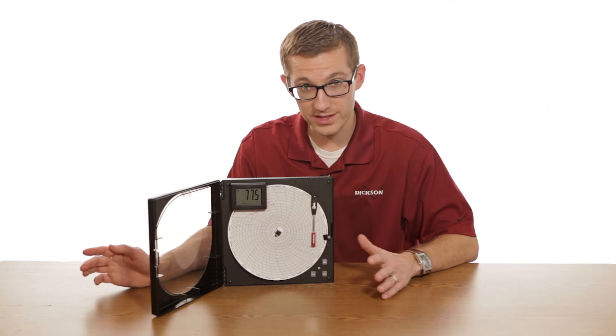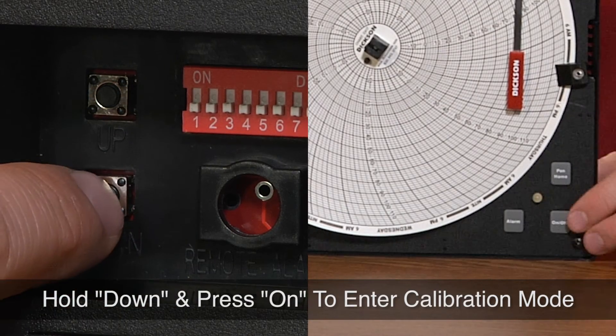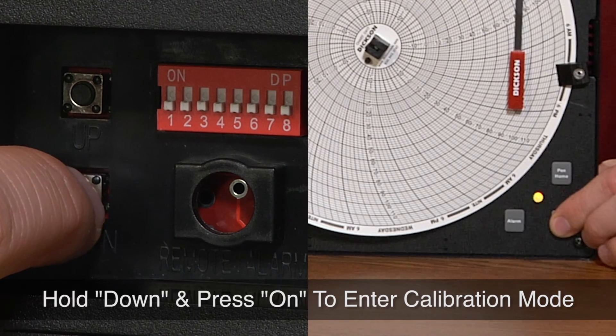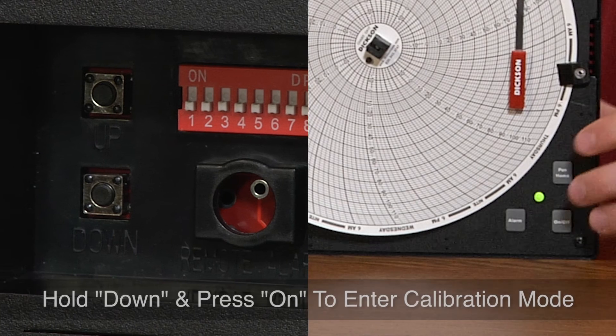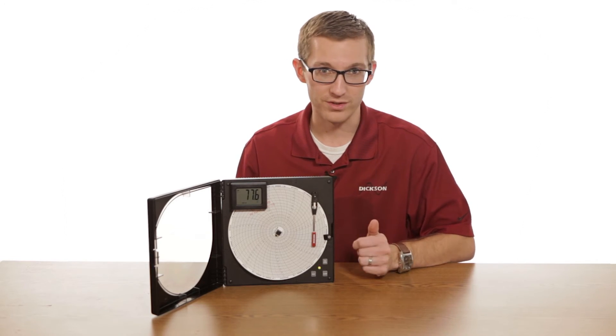So to start this process, you want to hold down the down button on the back of the unit and then the on off button. You're going to get a blinking light down there in the bottom left and that blinking light turns green, you're good and you're into the calibration mode. It's important to note that you always want to hit the down button first or you'll turn off the unit.